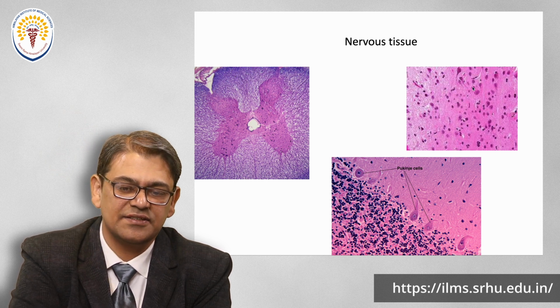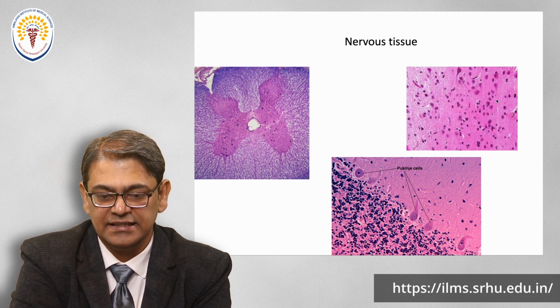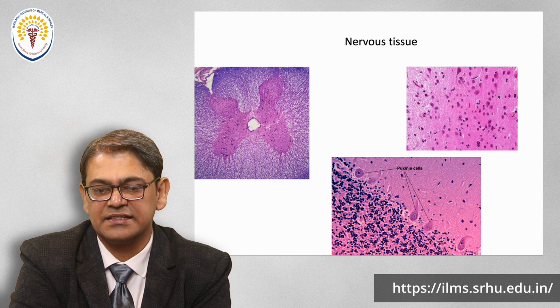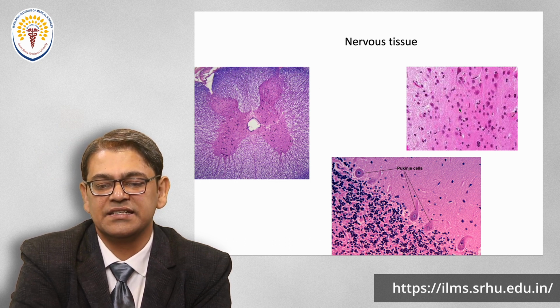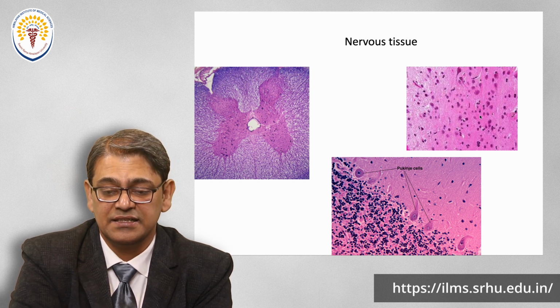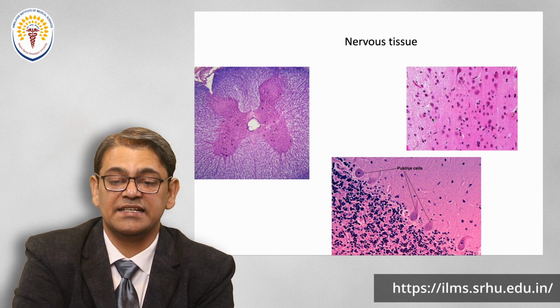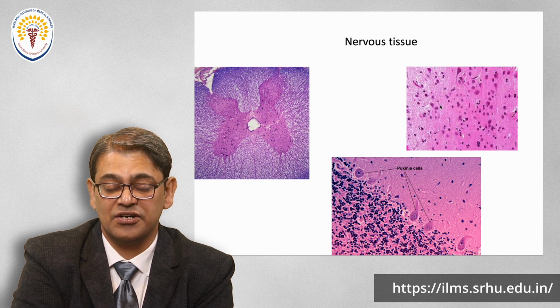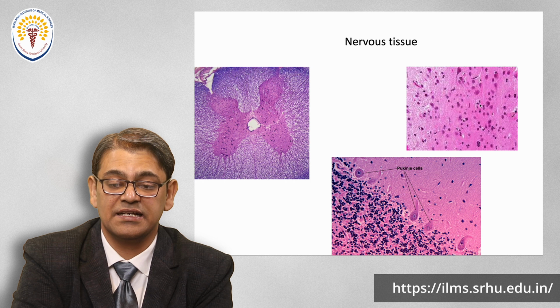Now we switch to this diagram. It is a slide of the cerebral cortex. What we see here is a ground pink color structure, slightly lighter here and darker here, with a slightly bluish tint. Various cells are present in this structure. Here it is scanty and short in structure, and here the cells are a little bigger and more in number.